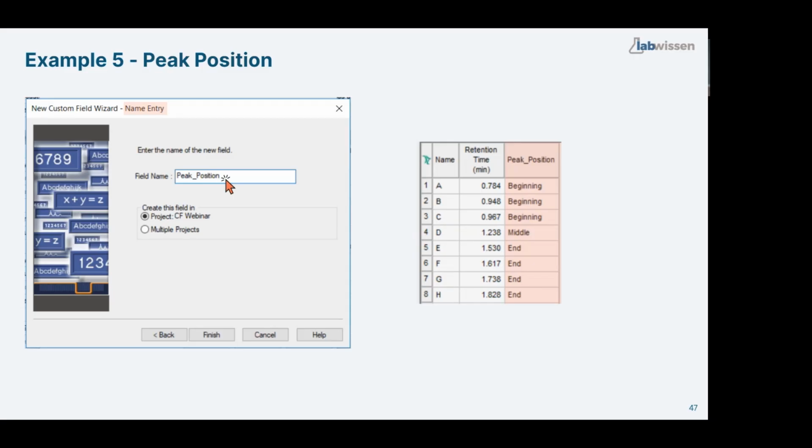Another question, very good one. Is close and project for all users? Yes, yes, yes. Usually you don't have this problem when you create a custom field. From my experience, you have a lab, maybe you have 10 analysts, and you usually have 1 or 2 people, better 2, that are very good in custom fields. So it's only you who create custom fields in a test project. I cannot assume there are 10 people simultaneously working in this project, but yeah, better close it. So usually it's like one person developing the custom field, another one checking the custom field, working on validation, and then you copy this custom field to other projects.